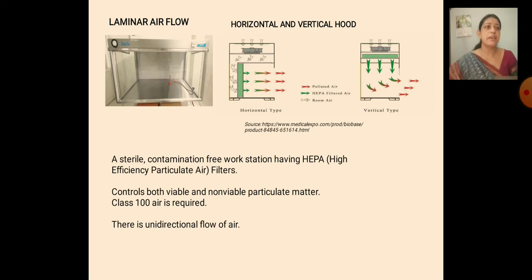Whenever you work here, the first thing you should do is switch on the UV lamp, keep it on for 5 minutes, and please do not stay in front of the UV lamp. Switch it off and then start your work. After the work ends, switch on the UV lamp again so that any microorganism present will die. Then always start the blower for 10 minutes before you start an experiment, so that the particulate air present gets cleaned.